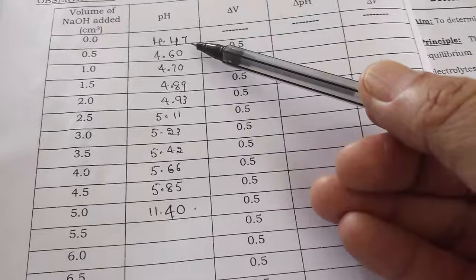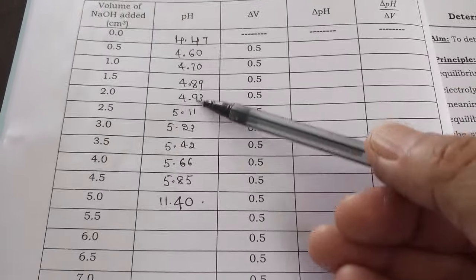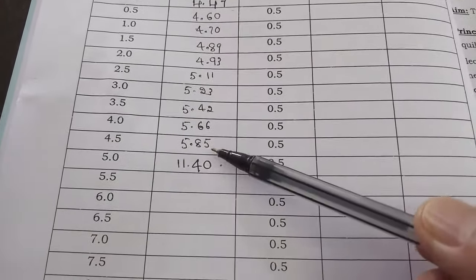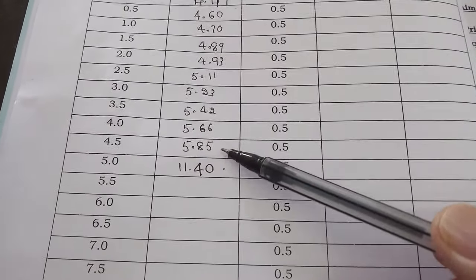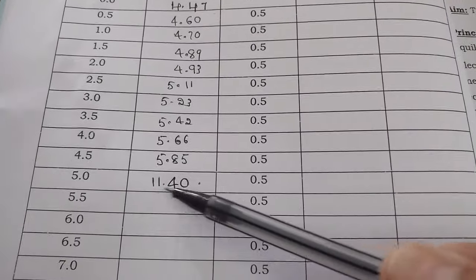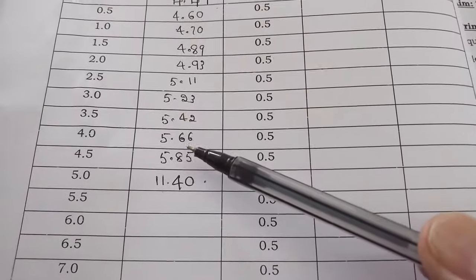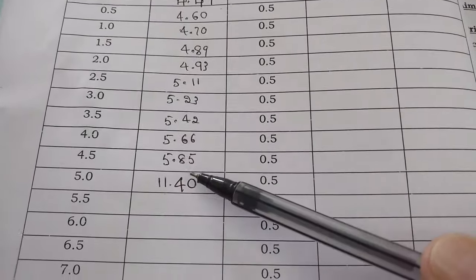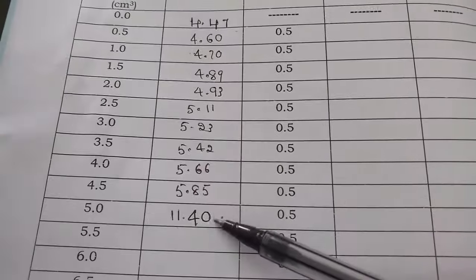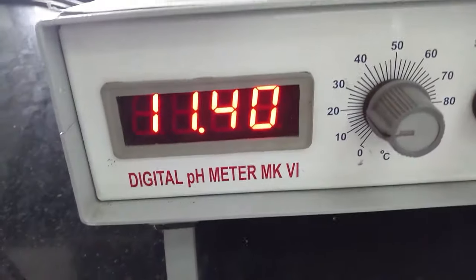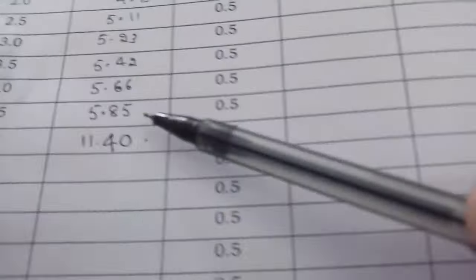So solution is neutralizing. After 4.5, between 4.5 to 5, the solution is completely neutralized, and at 5 ml the pH increased to 11.40. So between 4.5 and 5 ml, the given acetic acid is completely neutralized as per this pH value. Here you can see 11.40, this is at 5 ml addition of NaOH.